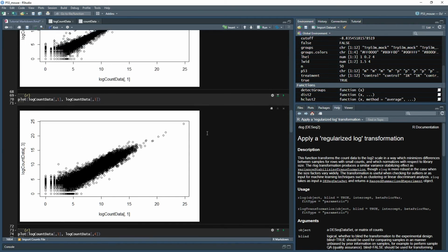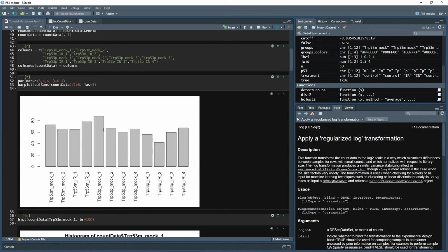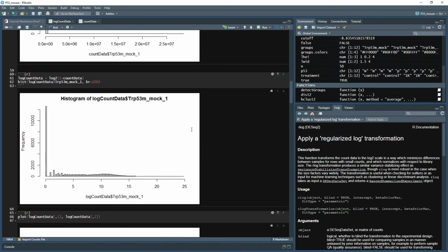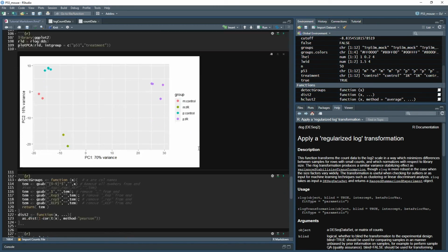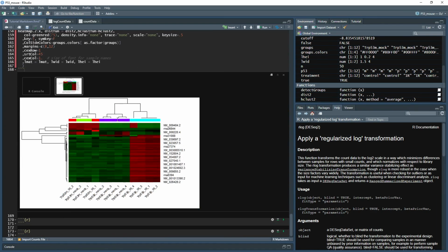Gene ontology stuff. But yeah, this is a good step in the right direction, that we can see P53 positive mice are in fact acting different, or have different expression profiles in their transcriptome than the other ones.